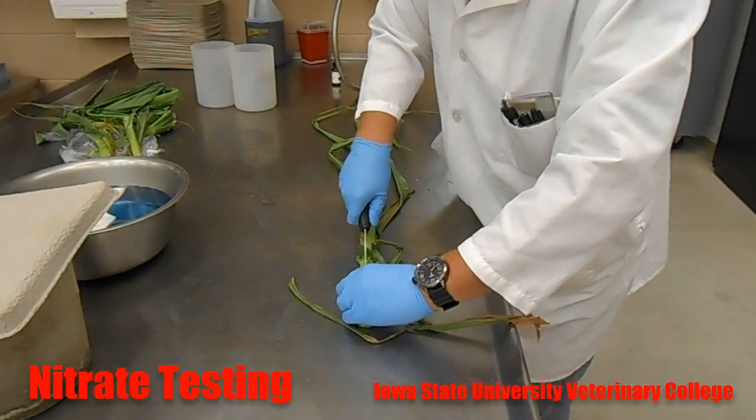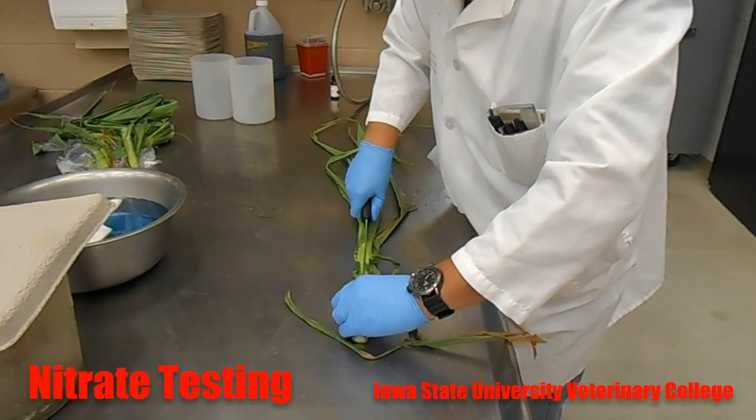We're demonstrating how to do the diphenylamine test for nitrate in the corn stock.